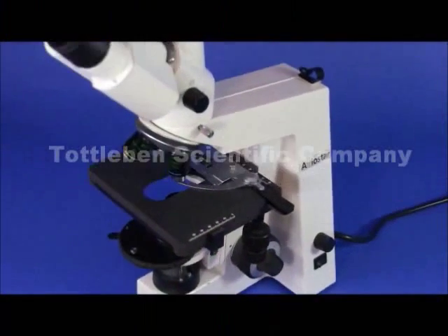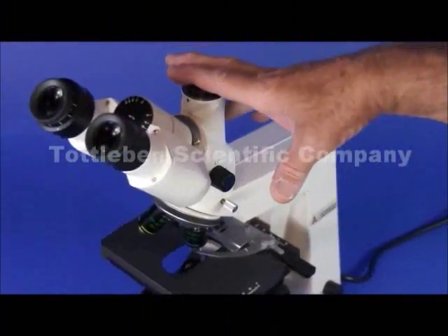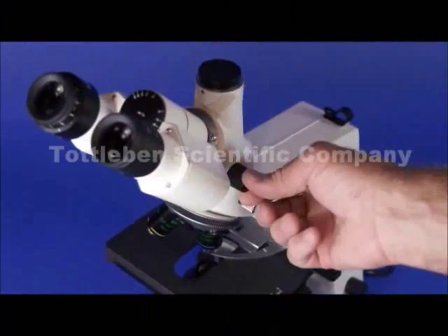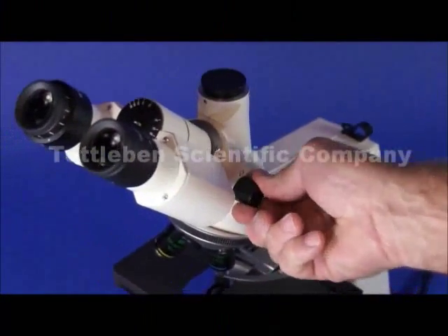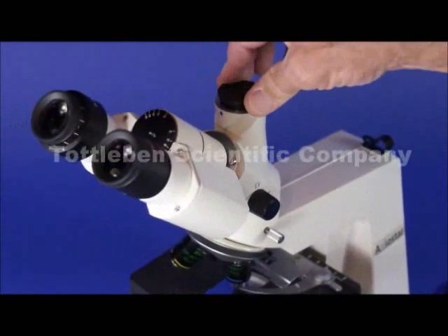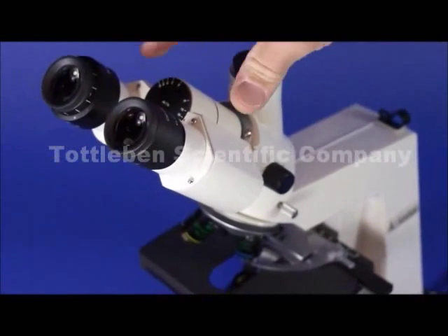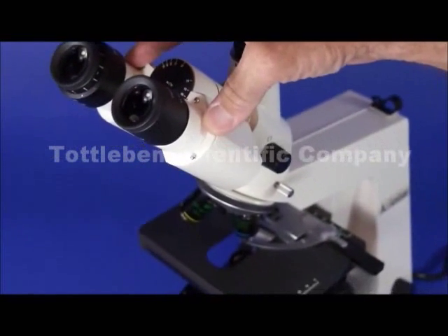This is a Zeiss Axios Star Microscope. It's equipped with a trinocular head for photography, a light path selector to direct the light both to the photo tube for photography and also to the eyepieces for visual observation.